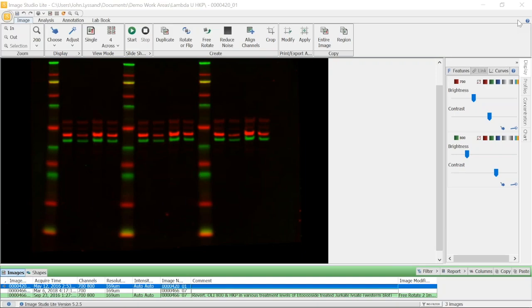Hello. Today in this section, we'll be walking through how to properly normalize a protein of interest using a validated housekeeping protein. Before using housekeeping proteins in a normalization strategy, such as this, you must always keep in mind that you need to validate the housekeeping protein first. Many journals now require a validation if you plan to use housekeeping proteins to ensure the experimental conditions you're using do not affect the housekeeping protein and thus ultimately your data.